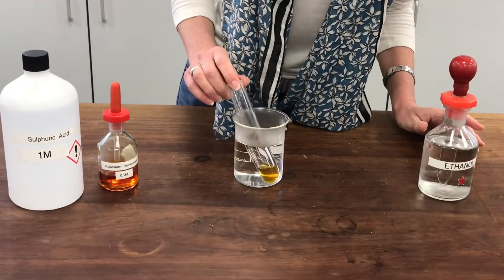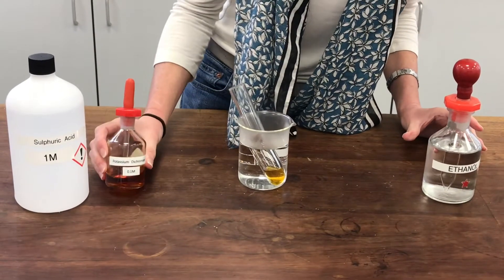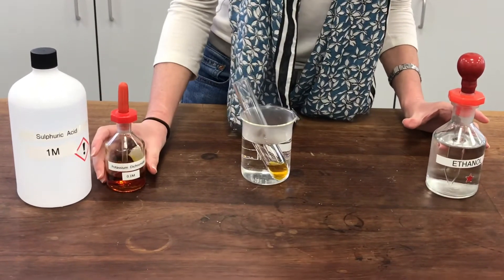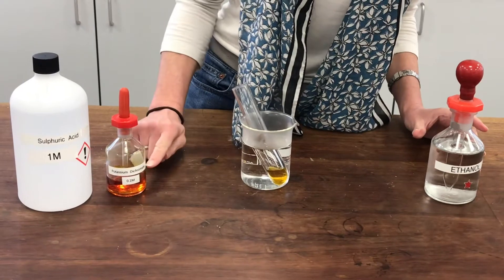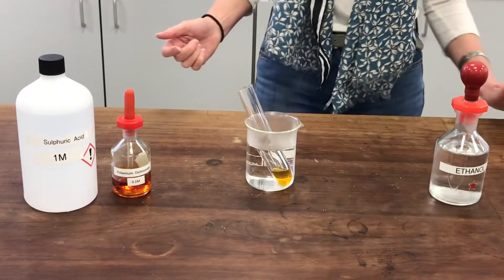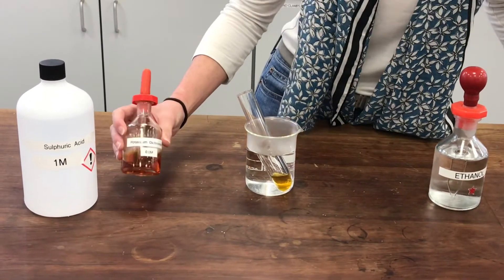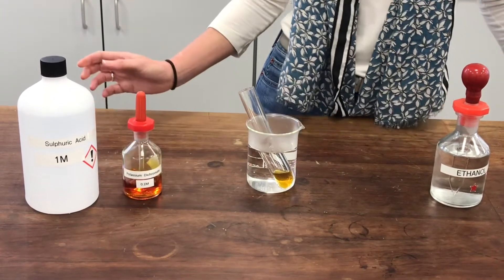I'm hoping to see a colour change, and that will show me that the potassium dichromate has done its job — it has oxidised the alcohol, and in the process the potassium dichromate itself will have been reduced. So we'll see it change to a green colour, to indicate the formation of chromium 3+.